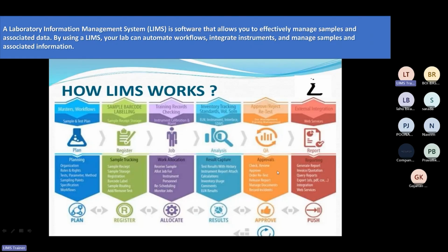Then comes the external integration. Suppose we need to share that particular data with another laboratory, or we need to share it with the regulatory side. That's where the LIMS software helps. So all our work becomes easier with the software.